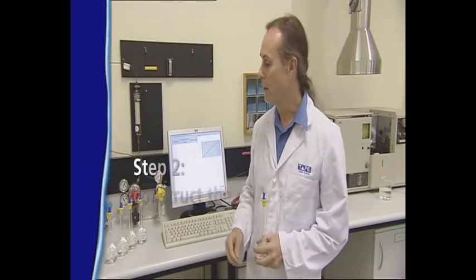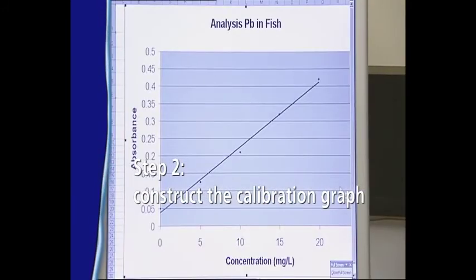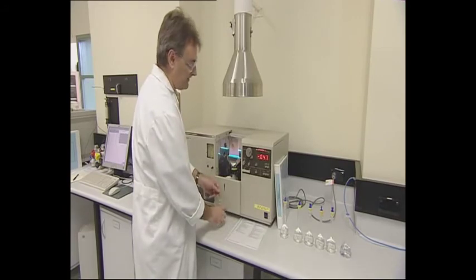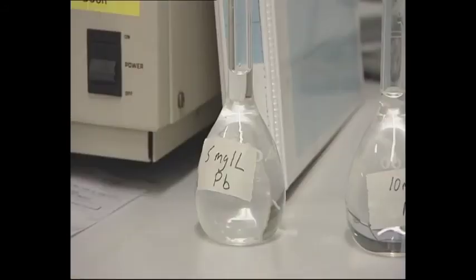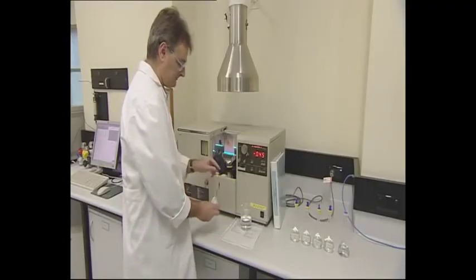Once we have our sample ready, we need to prepare a calibration graph. This is done by preparing a set of accurately made solutions, then recording their values on the atomic absorption spectrophotometer. You can participate by preparing your own calibration graph. First we need to zero the instrument with a blank, which is simply dilute acid. Okay, we're now ready to move on to the first standard, which is 5 milligrams per litre.